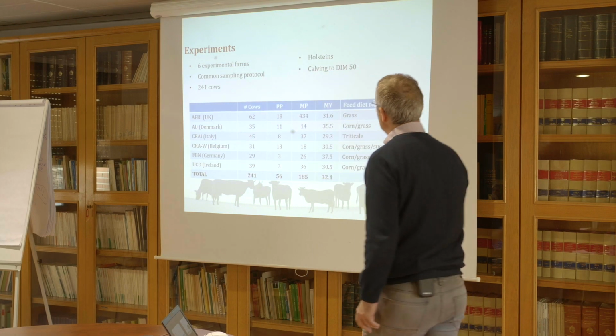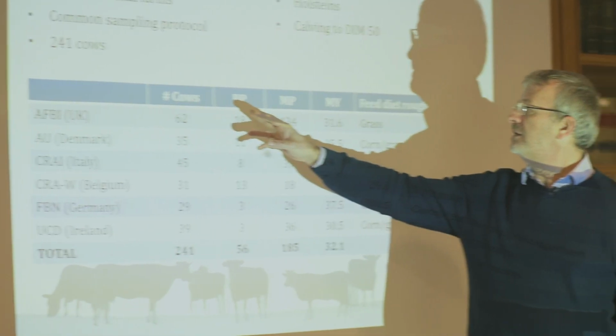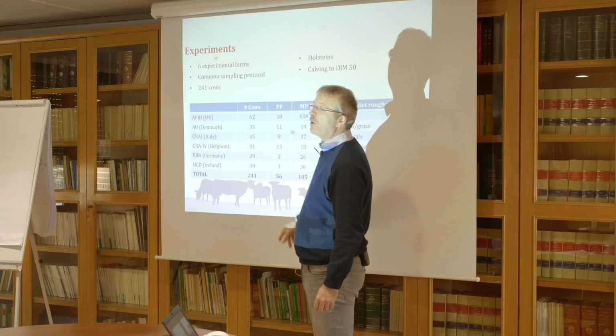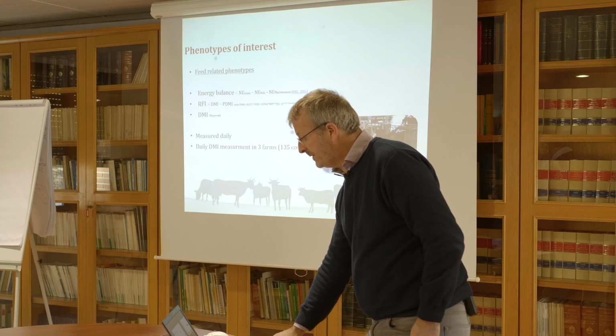And we also cover another variability. I didn't speak about that, but you also need to be sure that your models work on primiparous and multiparous cows. It depends on the parity. And it's good here, we have a good distribution.